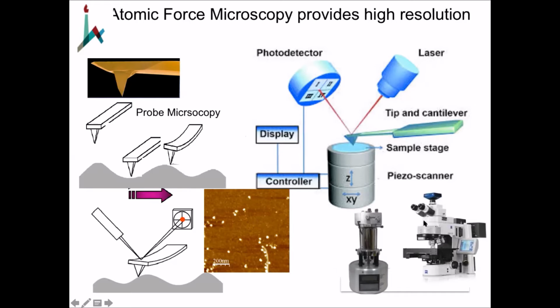Now, the bottom line is that you can see even in the microscopes that are available even today, this is the cylindrical piezo, okay? But the point was that most of these microscopes, even today, have no concept of how to do this effectively to integrate with optical microscopy.